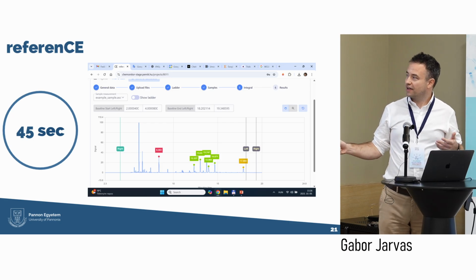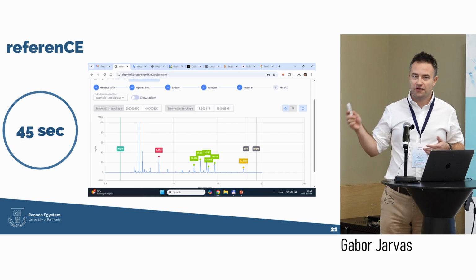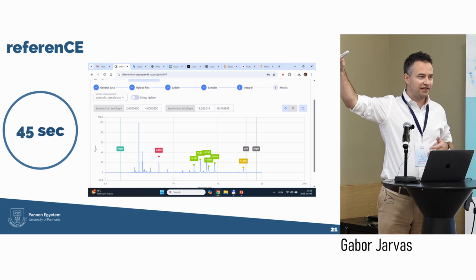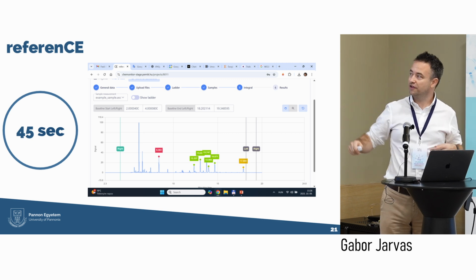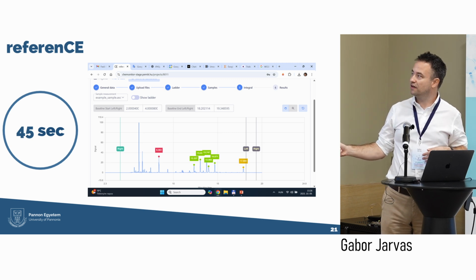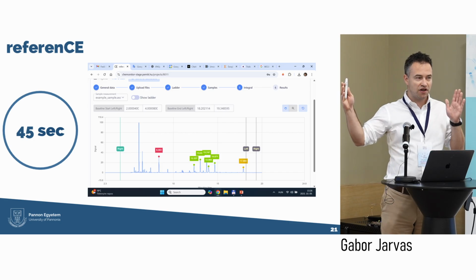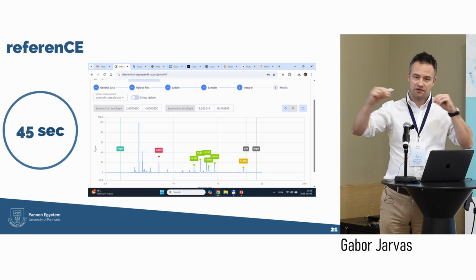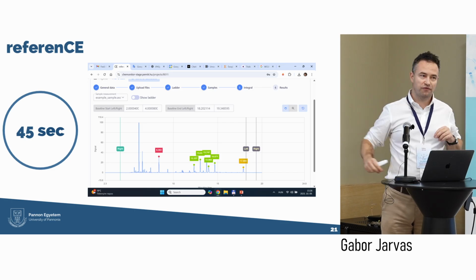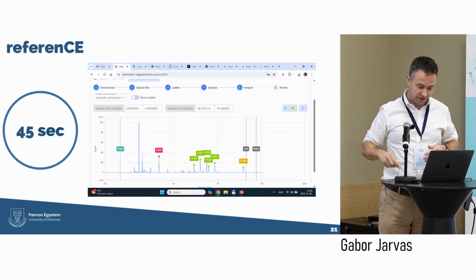In a simple case like this, it's so obvious that you can use it here, but if you have, for example, an increase in the baseline, then it's very tricky to set up the baseline for the integration. This is why we decided not to pick just one point of the baseline, but a range, and it will calculate the average, and that will be used to set up a proper baseline for the whole integration along the whole trace.